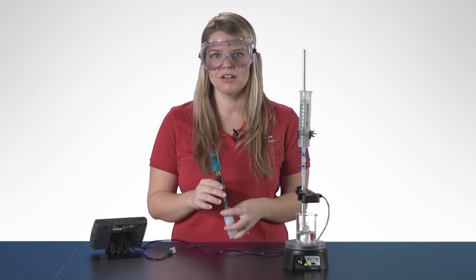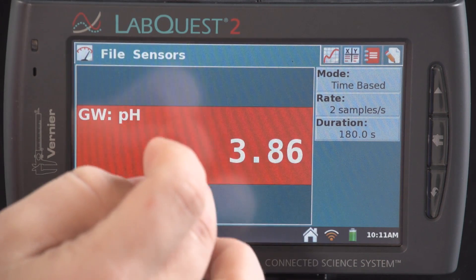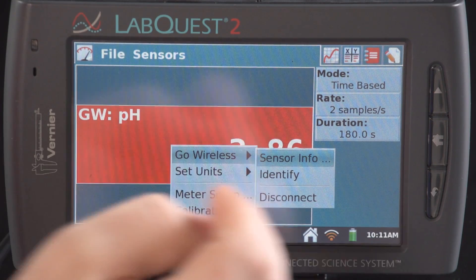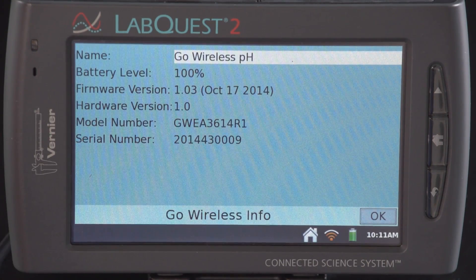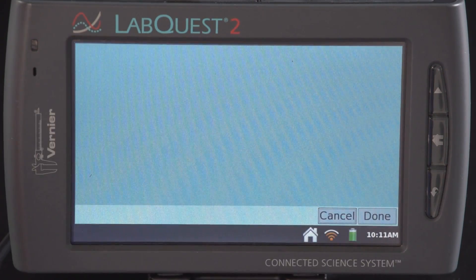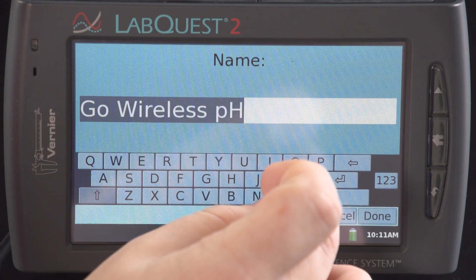Before we begin the experiment, let's take a quick tour of the settings on the Go Wireless PH. First, we're going to want to rename our Go Wireless PH so we'll know easily which one to connect to in the future. To do this, I'll tap on the big red box, then the Go Wireless menu, then Sensor Info. Next to the name where it says 'Go Wireless PH,' I just tap in that field and rename it whatever I like.